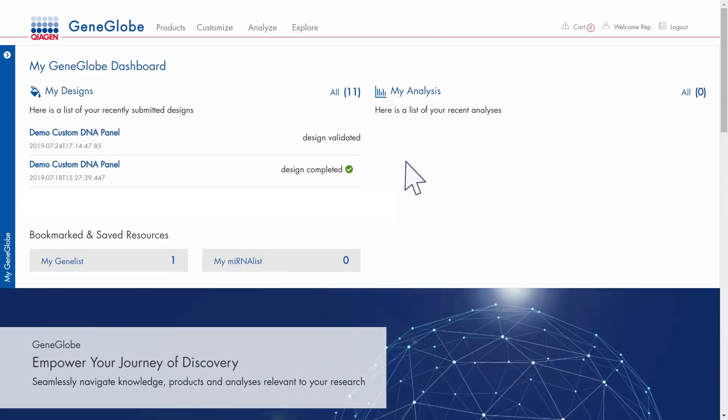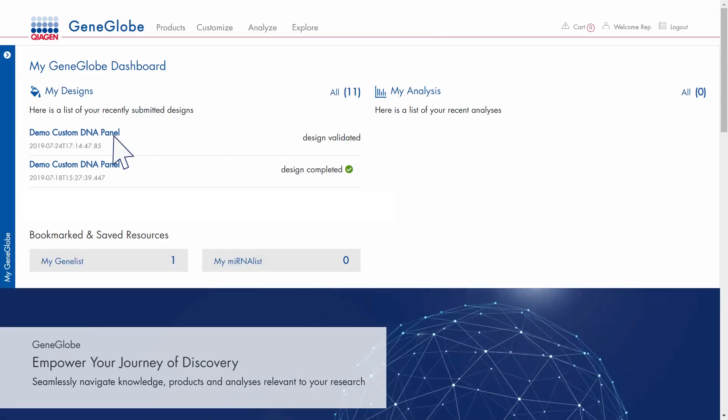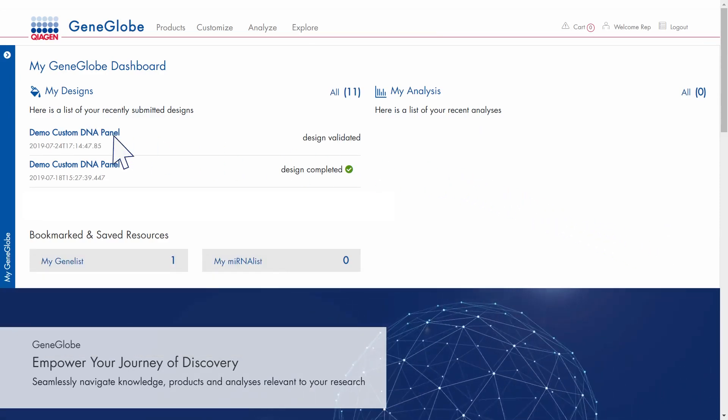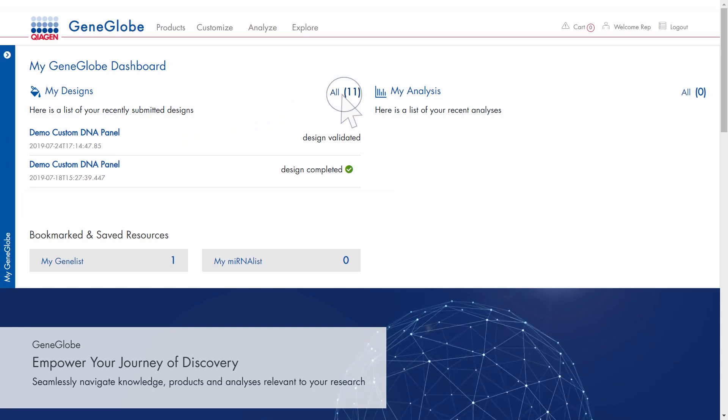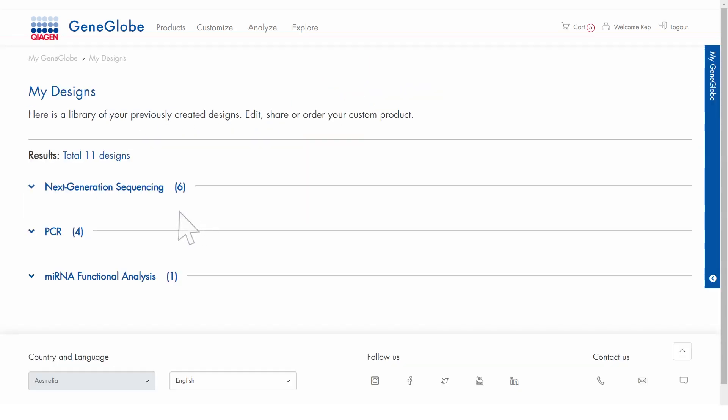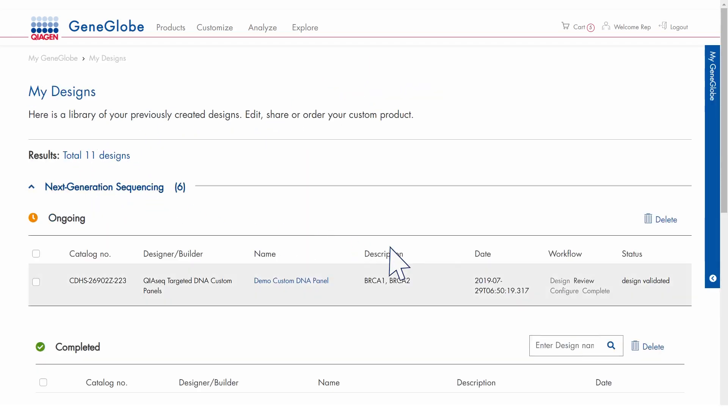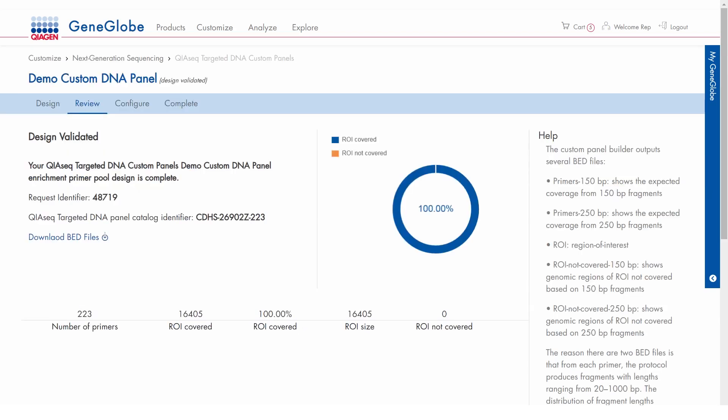You can access your most recent designs directly or click All to open the entire list. Check the status of your designs in the workflow and status columns and click on the design name to return to your design.